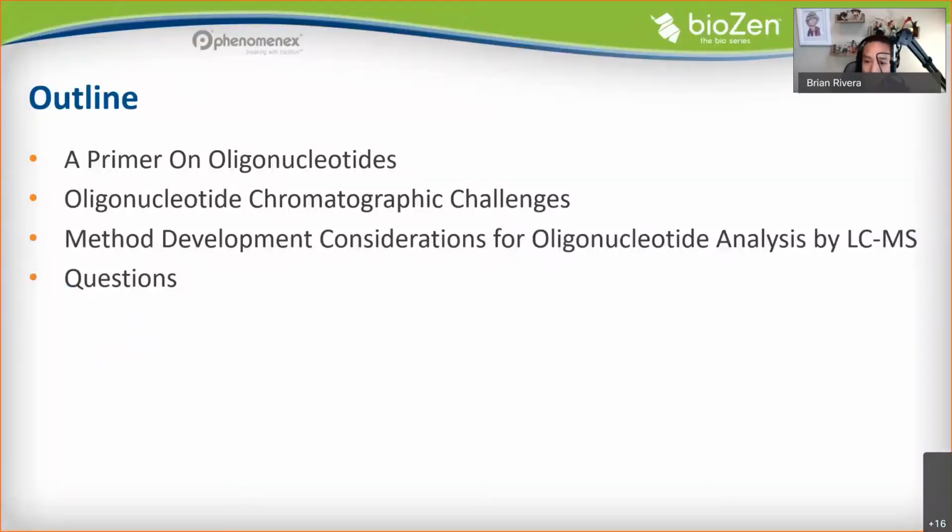So as a primer of the presentation that I'll be giving, just an overview of oligo chromatographic challenges, and of course the bulk of the presentation on method development and the considerations that one must have for oligo analysis by LCMS.